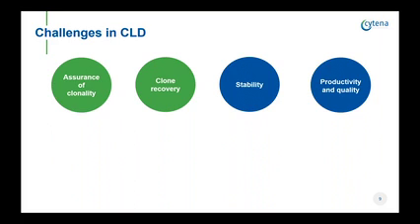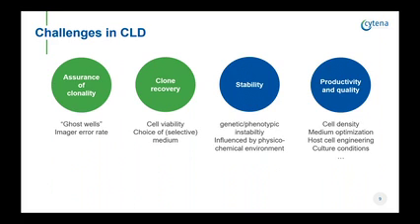And downstream of the single cell cloning, the major challenges are associated with cell line stability and productivity, as well as product quality. These are all parameters that have to be guaranteed for the final production clones. The current gold standard for assuring clonality is automated well imaging. This technology, however, is not error-free.